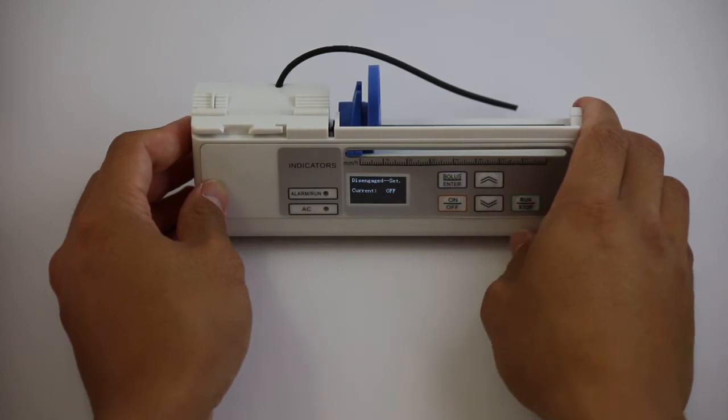When changing settings, press enter on the setting you would like to change, then press the up or down arrows to select your preference, and then click enter again.